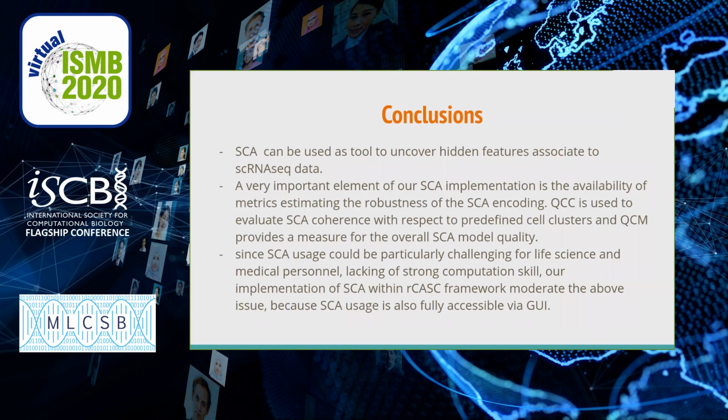Since SCA analysis would not be so user-friendly for non-IT personnel, the algorithm is implemented in our workflow and, of course, is accessible also by graphical user interface.